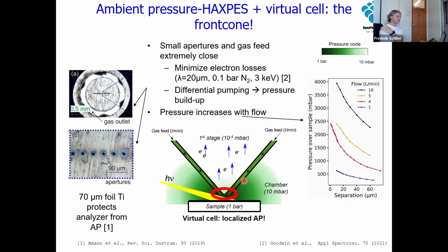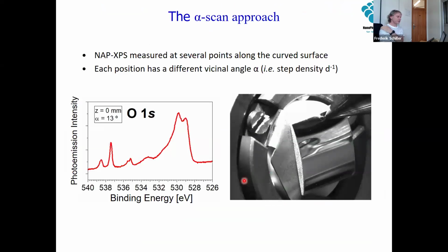So we will still start first with the simple photoemission, the NAPs that we can do, for example, in our lab, and this was done here in MAX IV in the synchrotron.